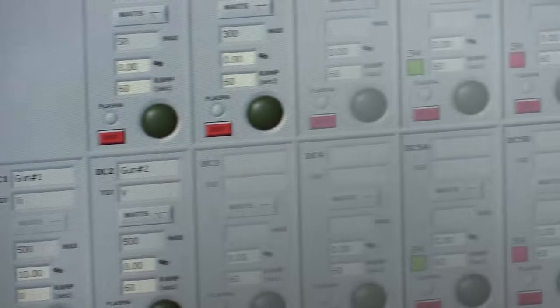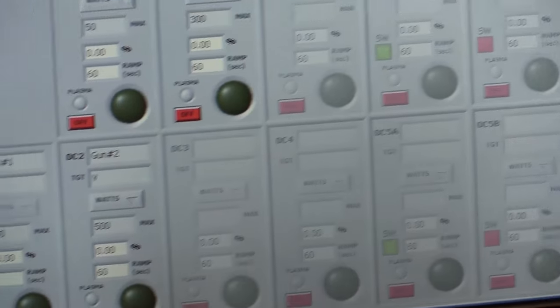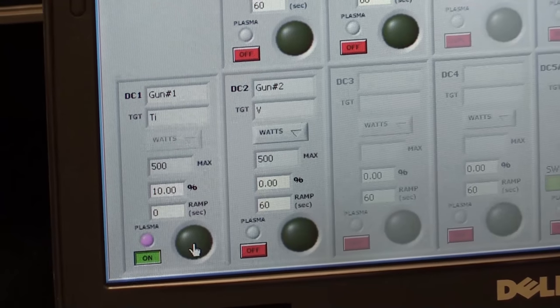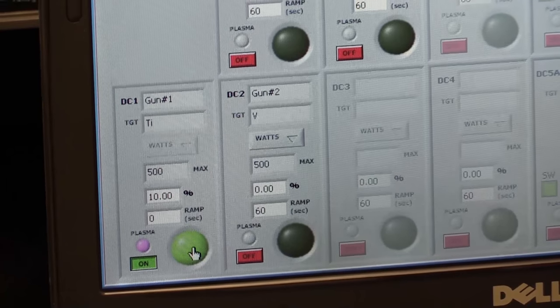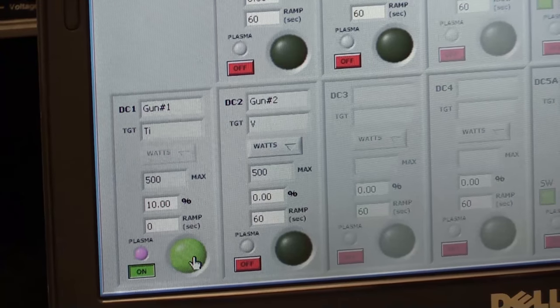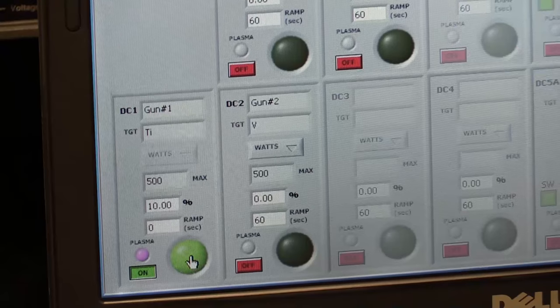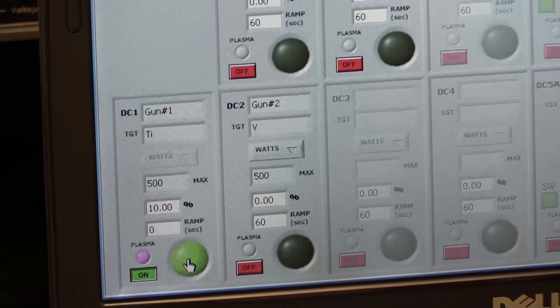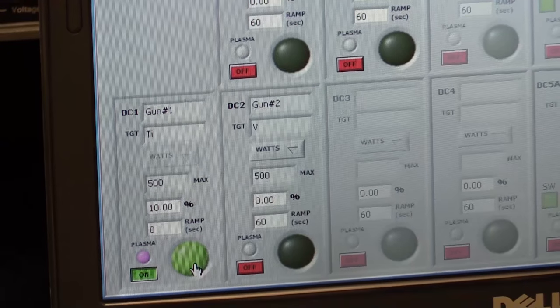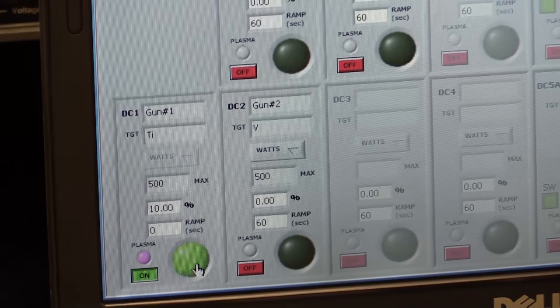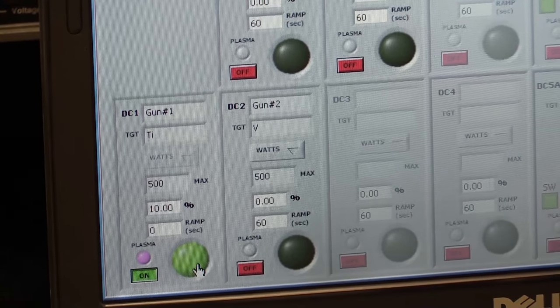Now we'll go ahead and deposit the film by opening this chimney shutter. With this green light, it shows that we are depositing our thin film on our substrate. Typically we do this for anywhere from a few minutes to possibly hours, depending on the desired thickness. For this video, we'll just do this more quickly.